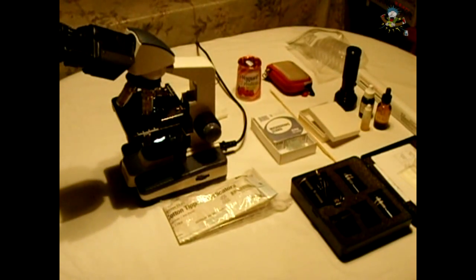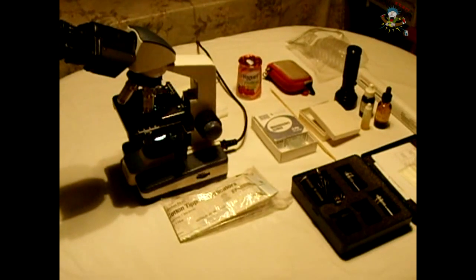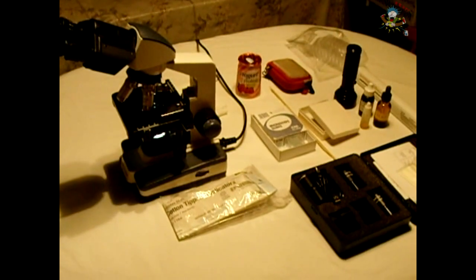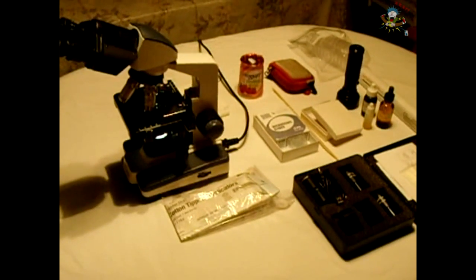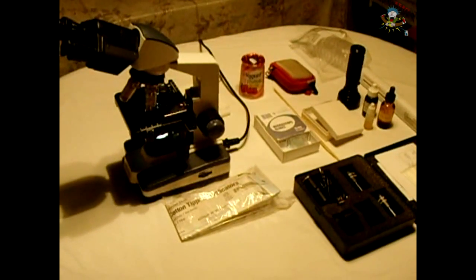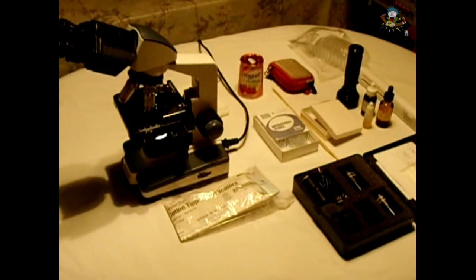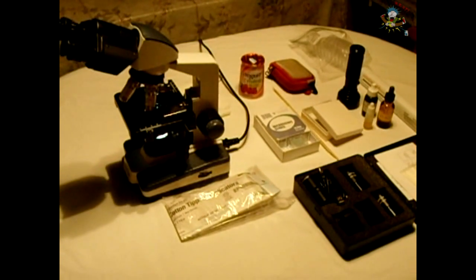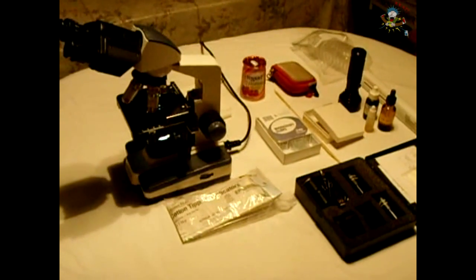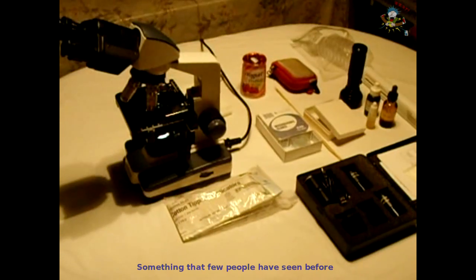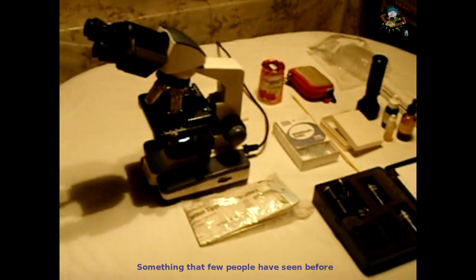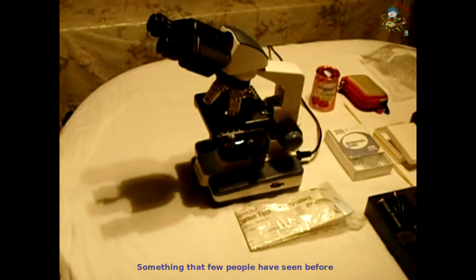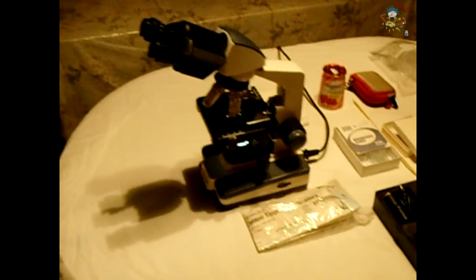In today's video we're going to be straying a little bit from the norm for the types of videos that I usually place on this channel, but I did feel that this would be a very interesting video that my viewers would like to see. What we're going to do is take this microscope right here and examine yogurt bacteria.